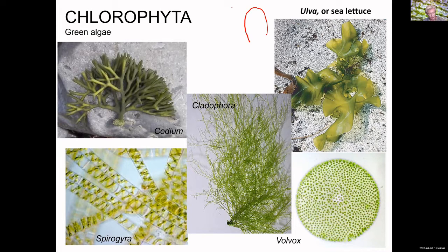They might form a filament, which is long and thin, and often we'll see a string of single cells. Then they might also have a branched body form where they have splitting of their stems, and they end up looking kind of like a tree diagram, right?